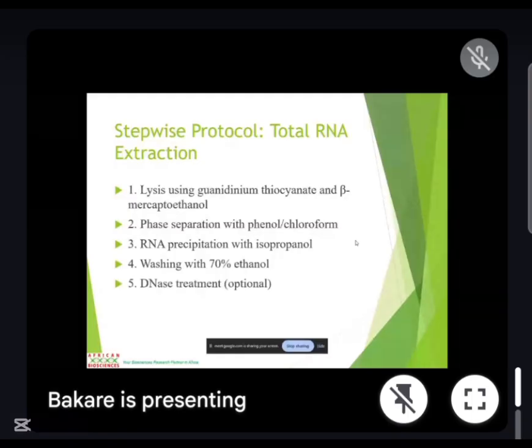When you want to use it, it's best to use it in an environment that is not open, that everyone can access. That's why when we want to extract, we have an extraction room that doesn't get to the air like that, because number one, the smell, and you cannot perceive it for a long time. So B-mercaptoethanol for RNA extraction, your phenol and chloroform as well.